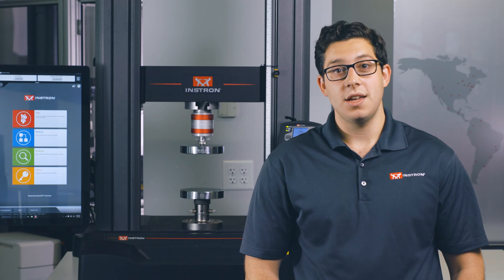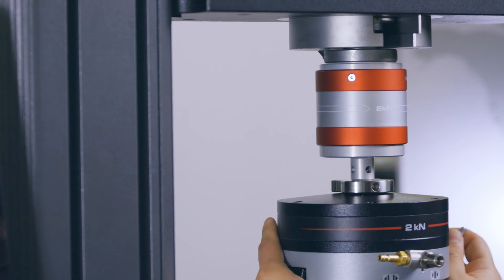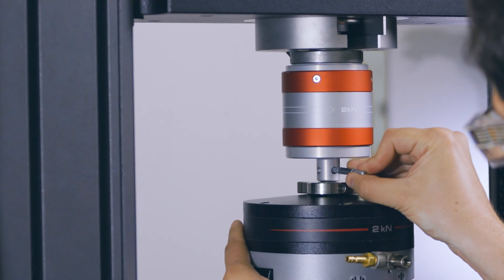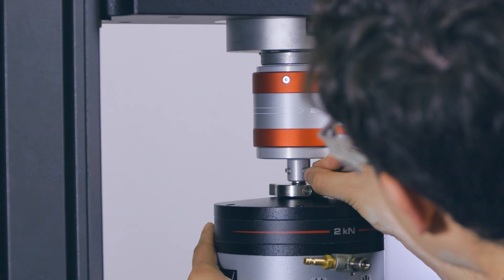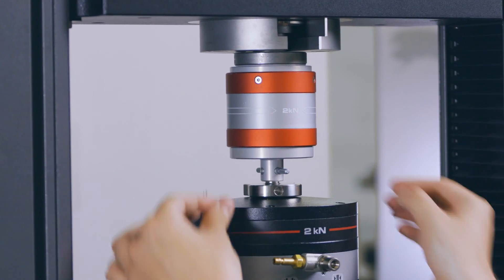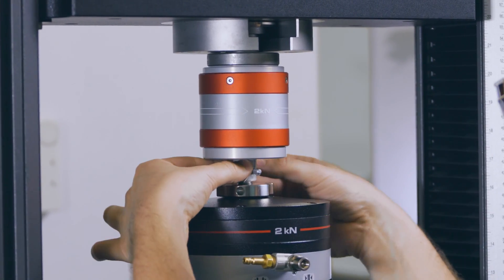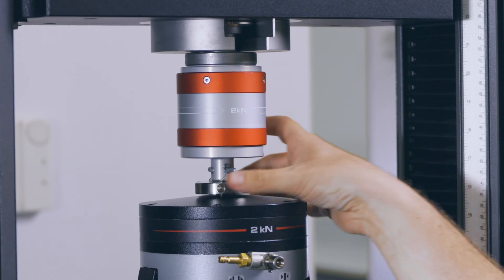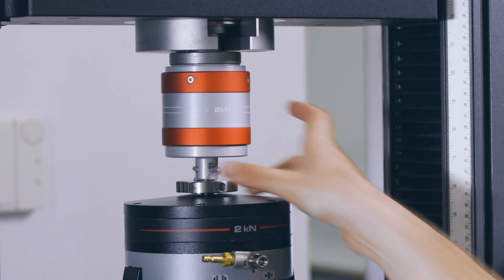All our grips and fixtures use the same pin and clevis style connection, which make it easy to quickly change fixtures as needed. Here we have a pneumatic grip that we are attaching to the load cell. Set the grip into the load cell, line up the holes and secure the grip with the pin. In order to prevent lateral motion of the pin, which could happen during a cyclic test, install the pin clip. Now tighten the check nut to the load cell.